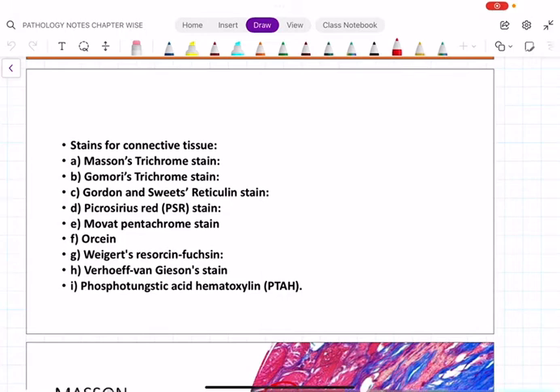For example, we are studying liver pathology, we are studying Wilson's disease. You know what the stain will be. Of course, it is rhodanine. In rhodanine, you know how the copper will look: brownish red in color. Modified Fouchet is for bile pigments. The bile will be emerald green in color.